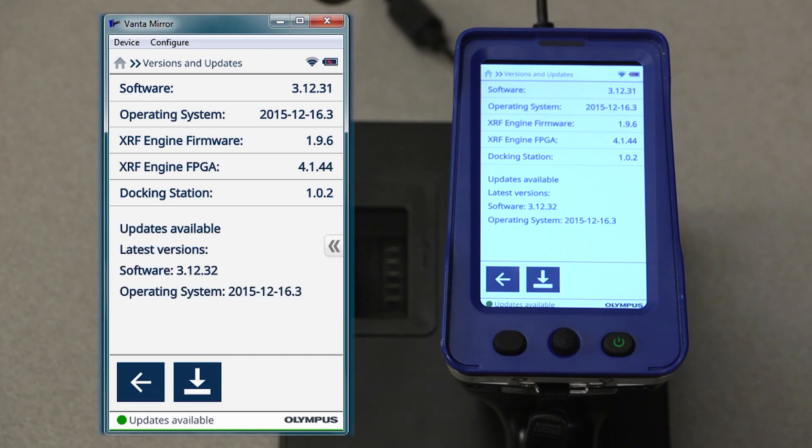In this case, we can see that an update is available. Additionally, there will also be an icon at the bottom of the screen indicated by an arrow pointing down at a bar. If no update is available, this icon will not display. In order to start the software download, simply click the icon at the bottom of the screen.